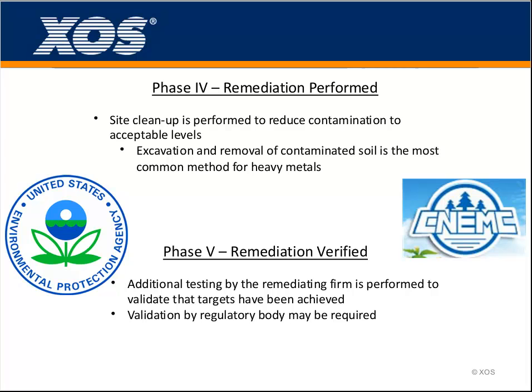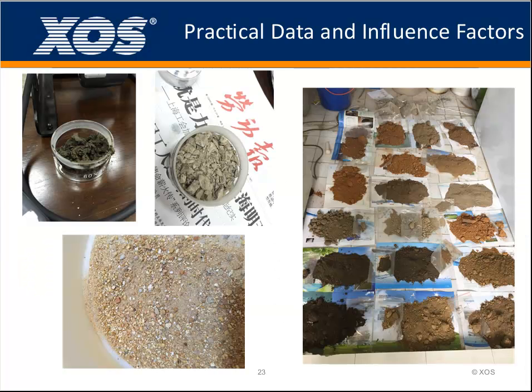And for the last part, remediation verification. When a brownfield has just finished remediating, it needs inspection from some government-owned institute or third-party institute. And before they give the sample and submit the result to the institute, they need to check themselves. And generally, after remediation, the concentration of heavy metal is very low in this part. So the first generation XRF cannot do well, but the second generation can do this much better.